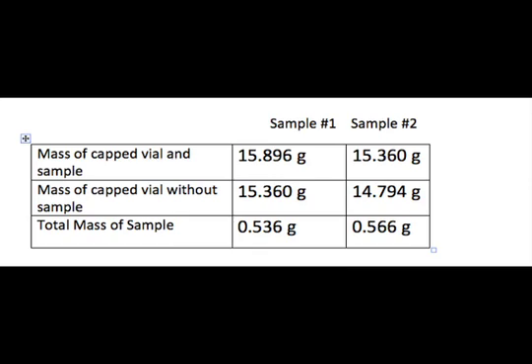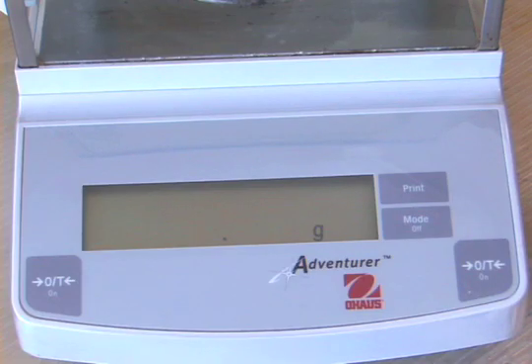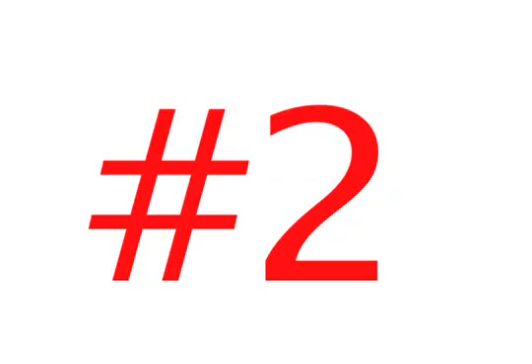To make sure that our mass is accurate, remember the following tips. Number one, always remember to wait for the star on the scale readout before recording the mass. Number two, make sure the balance is clean.